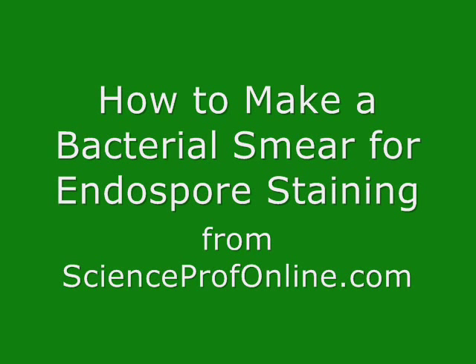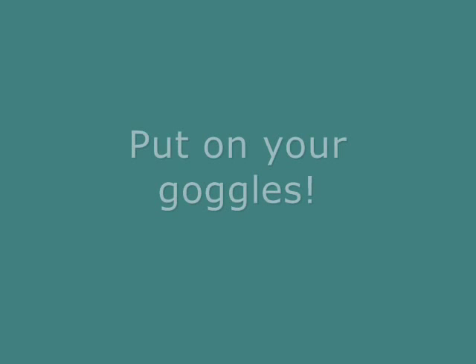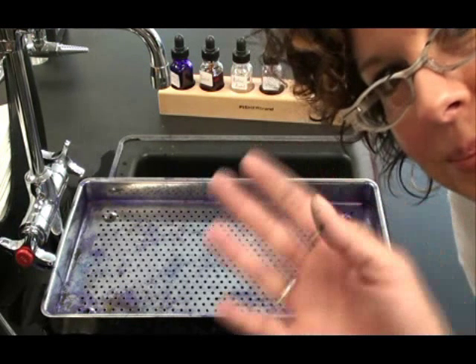In this video I'm going to show you how to make a bacterial smear for endospore staining. But first we need to put on our goggles. Hello!